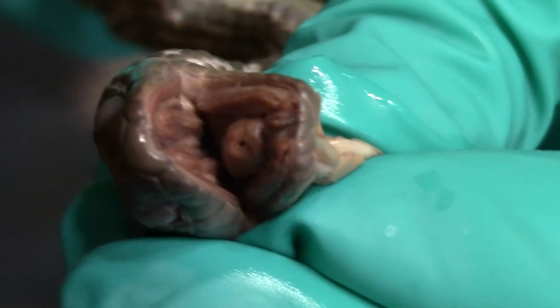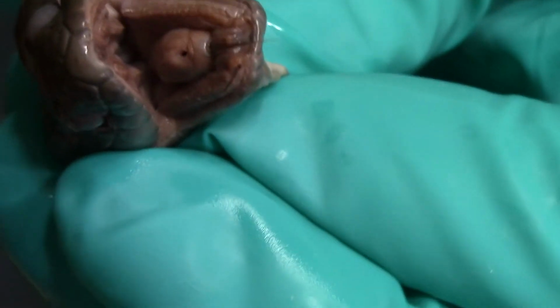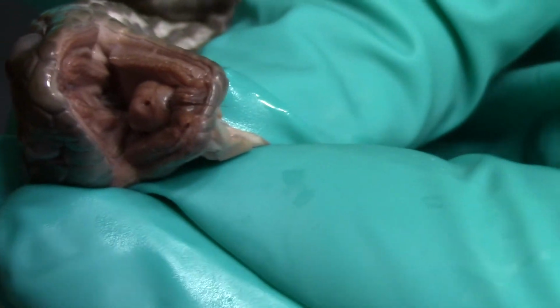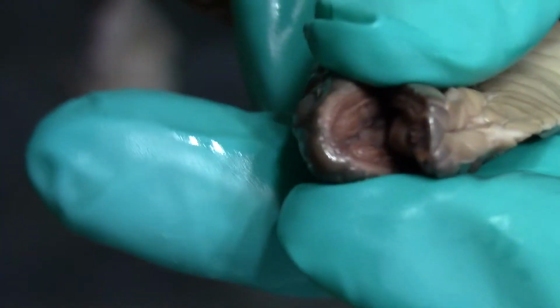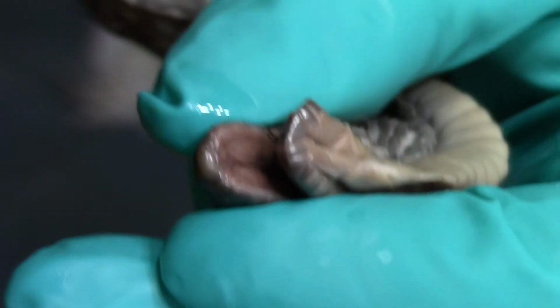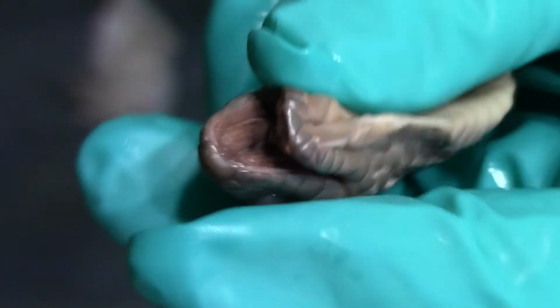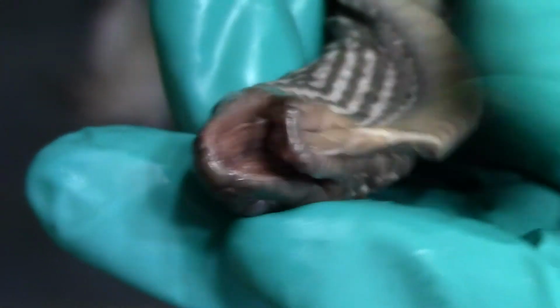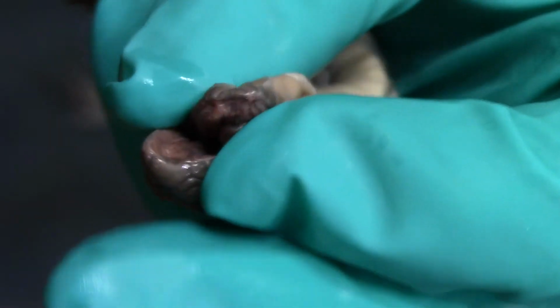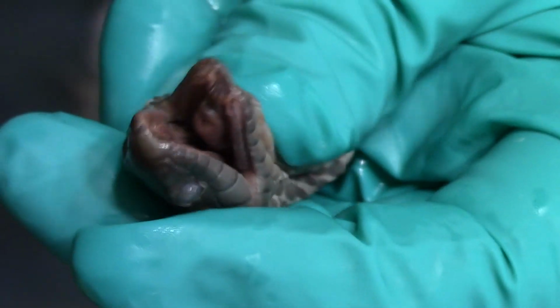If I open his mouth, you can see his tongue, his forked tongue there at the bottom, and the opening of the glottis is quite distinctive in this snake. You can tell that the two bottom jaws and the two top jaws are not a hard fused bone, that there's some articulation between those different joints that allow that snake to move its jaw and swallow much larger prey than you would think.